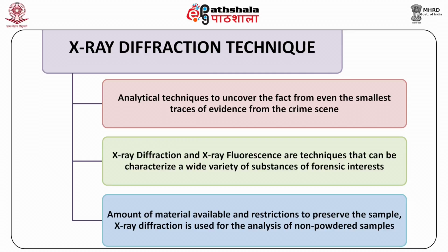X-ray diffraction and fluorescence techniques are such techniques which can be used to characterize a wide variety of substances of forensic interest. But because of the form and size in which the crime sample exists, the amount of material available and restrictions to preserve the sample, X-ray diffraction is rarely used.